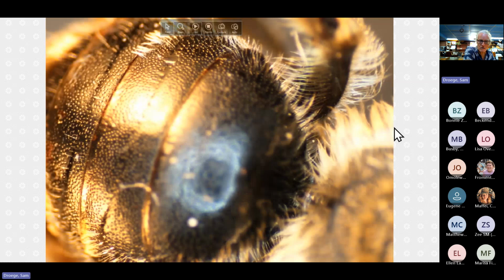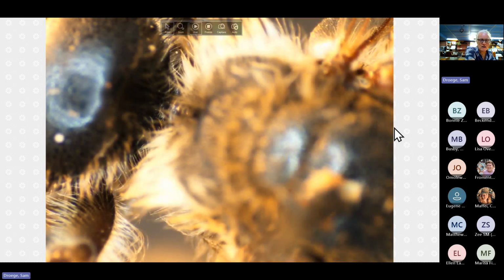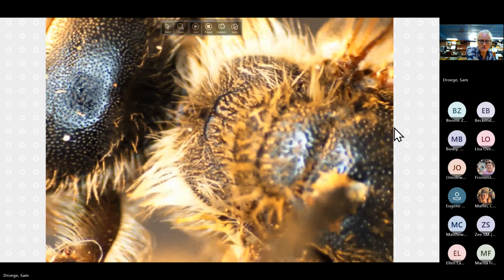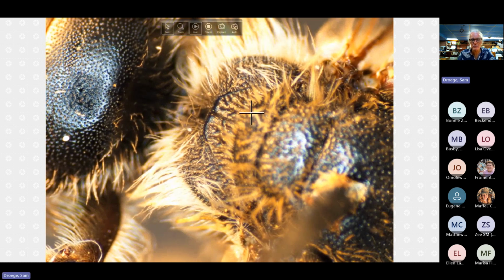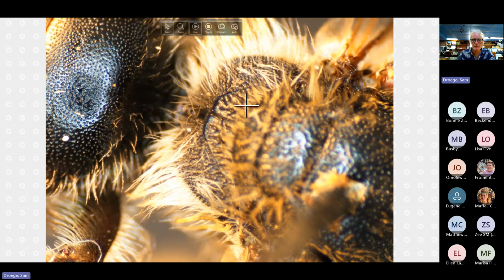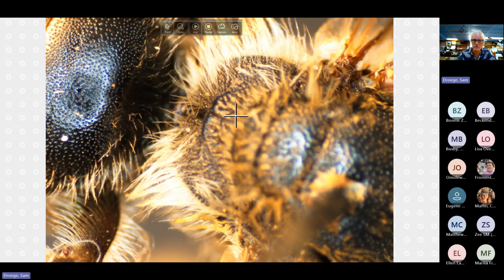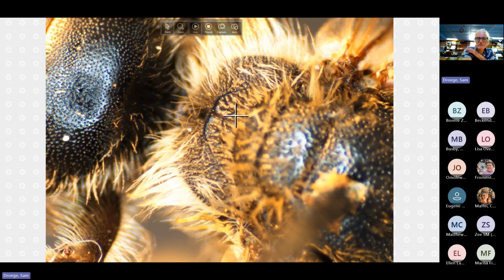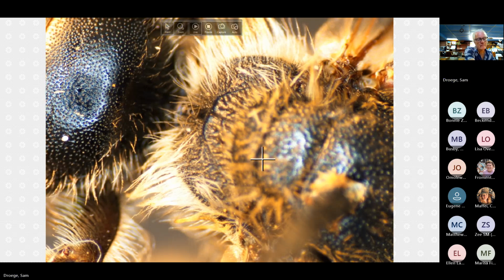What we're looking at is the propodeal triangle again. We're looking at the cell structure. And in general, there's a rectangularness. You can't quite see all of it back up here, but these areas are mostly chunked out in rectangles. Not perfect ones, but there's some linearity here in the edge of the propodeum.